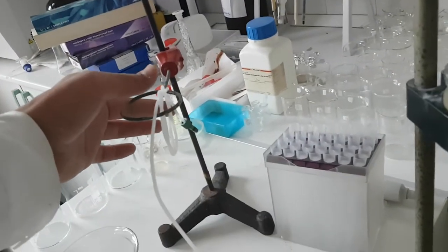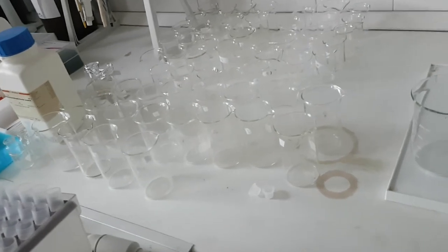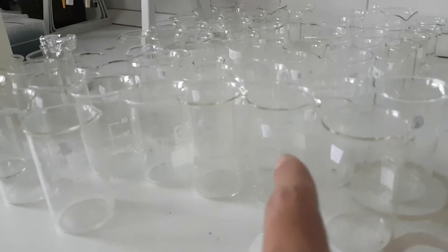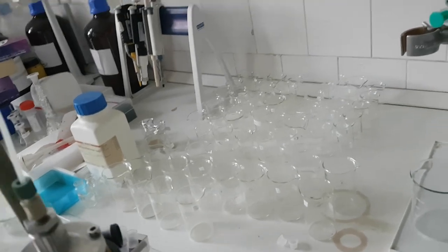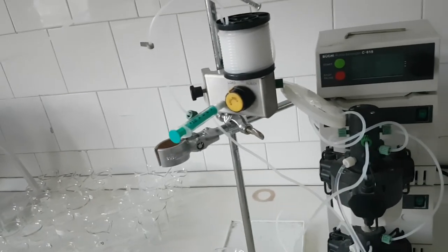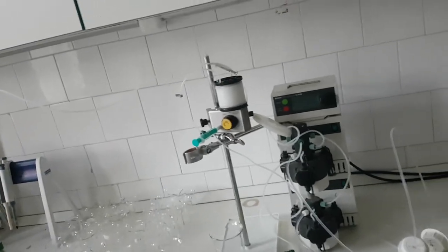This is where we recover the fractions. You need beakers to collect your fractions — you need to label them all. Here we have fractions 14, 16, 17, and so on. You inject by these points. There is quite a bit of work involved if you would like to recover molecules from plants or natural resources in general.